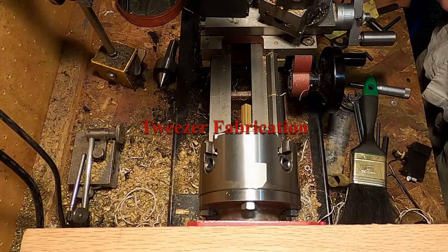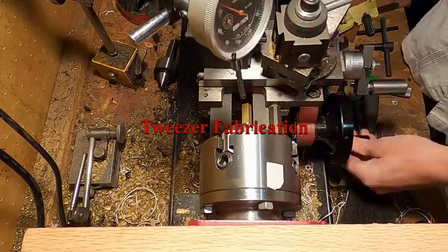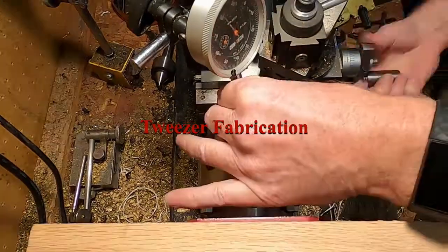After making the weights and the tray to hold them, I decided to make a set of tweezers out of brass that would match the rest of the design.